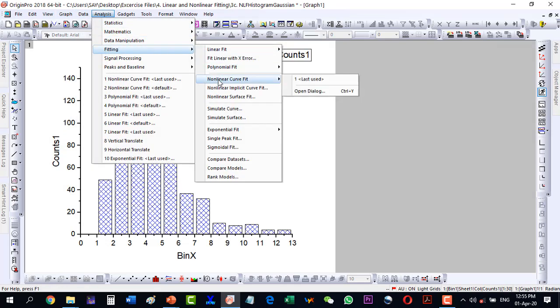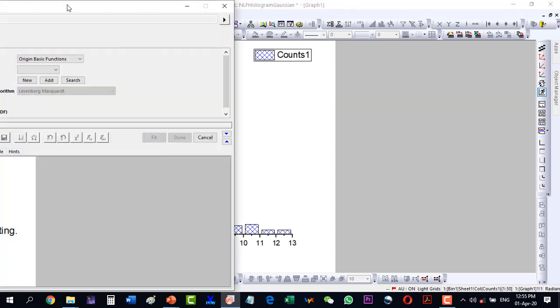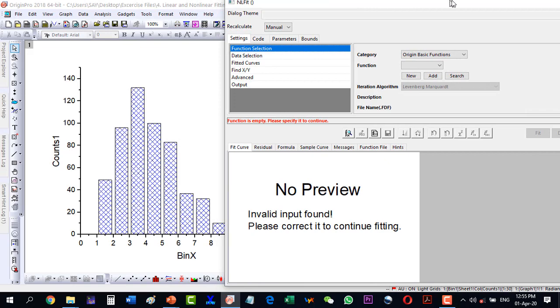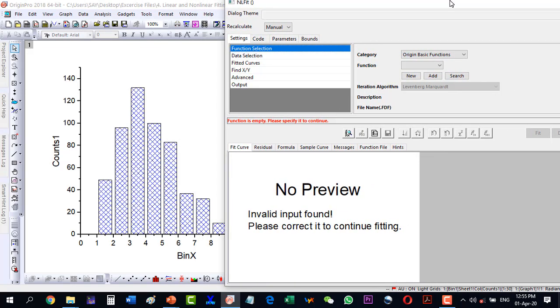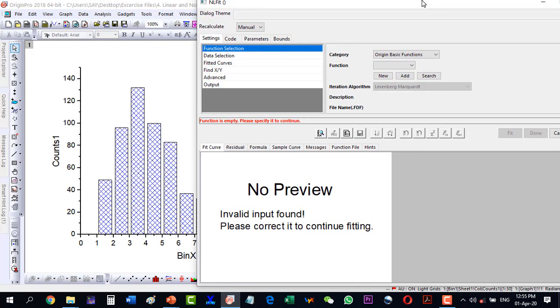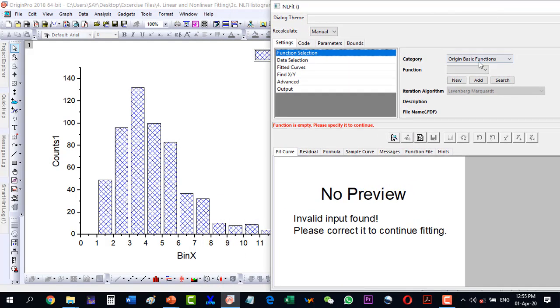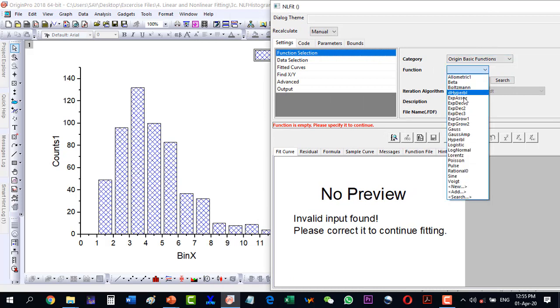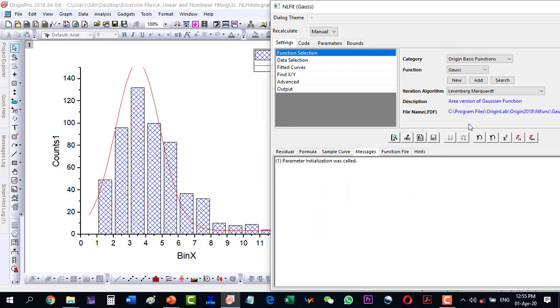Here we select our function as the Gaussian function. As I click the Gaussian function, I see the preview of this one and the Gaussian function is the same as we discussed earlier.